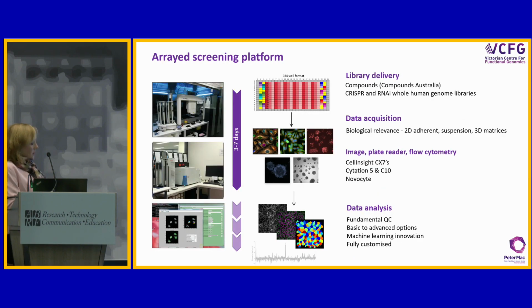We're working usually in a 384 well plate format. We deliver our agents into every well of these plates. We perturb for somewhere in the order of 3 to 7 days, and then we acquire our outcomes, whether they be imaging, plate reader, or flow cytometry typically. And then the data analysis is where it really gets fun.